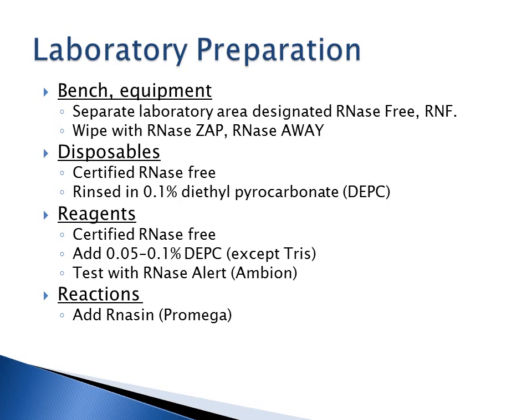Lab preparation. So we already said usually you're going to use a special room for RNA work. Your bench, everything has to be RNase free. You're going to wipe down with RNase away, RNase erase, RNase zap. There are many different RNase removing materials you can buy through any of the purchasing companies. Everything should be disposable and certified as RNase free. So you're going to want to purchase everything and keep it in a special area that's all RNA ready area.